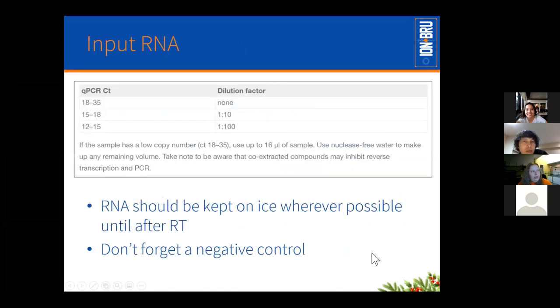So with your input RNA, again, I'll reiterate, your RNA should be kept on ice. I'm sure most of you know this. And don't forget your negative controls. You should take a negative control right through the entire process.